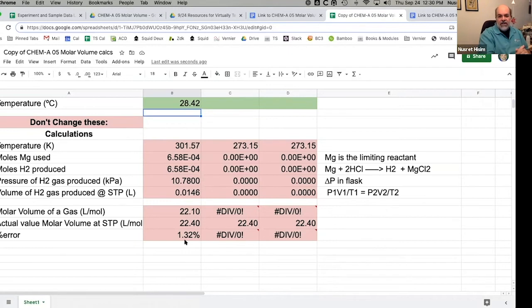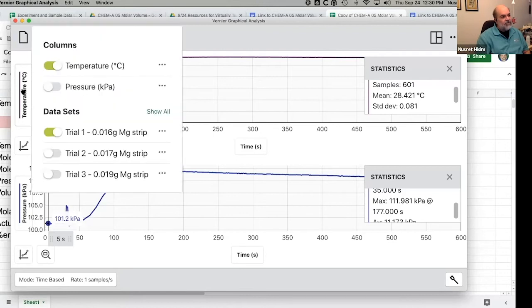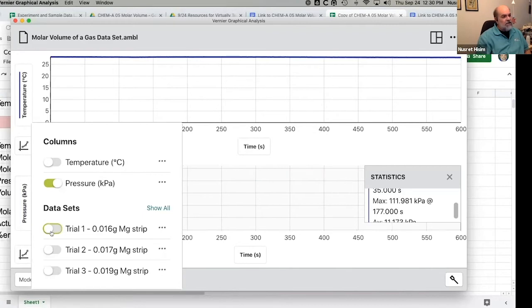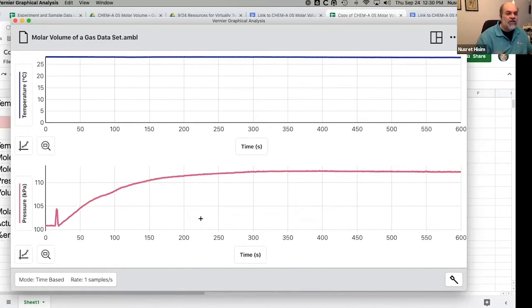I've got the sheet set up — you're welcome to use it or not. All three trials are in the video, and they're in the Graphical Analysis file. Just tap on the Y-axis. The same applies to temperature for the other trials — turn off trial one and turn on trial two, and the graph shows the temperature for trial two. Same for the pressure graph.